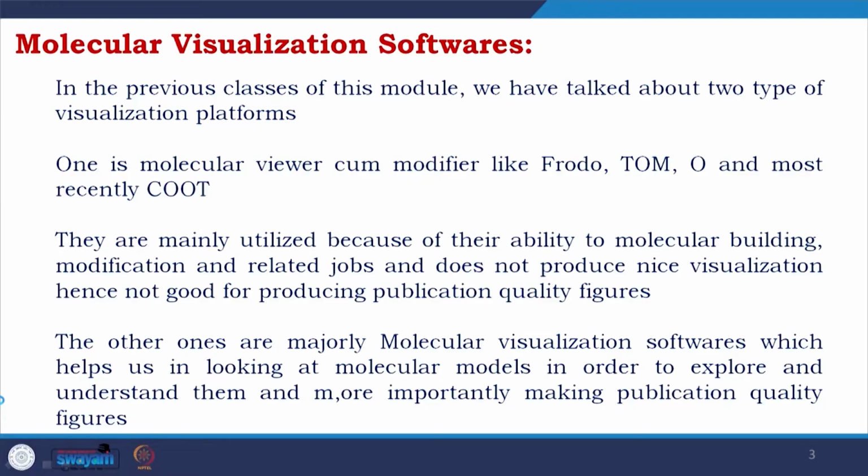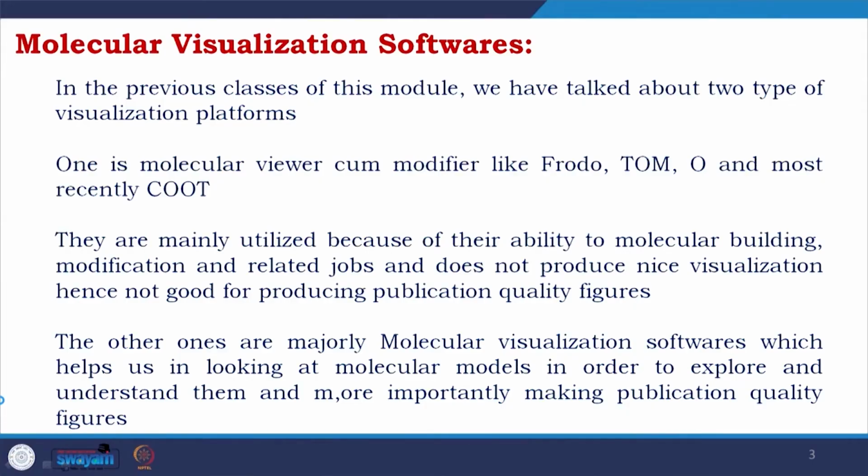So, yes, they are visualization platforms, but they are much more. They are majorly working on model building, like in crystallography you have electron density, you come to Coot and you develop the model from the electron density. The other ones are majorly molecular visualization softwares which help us in looking at molecular models in order to explore, understand them, to do analysis, and more importantly making publication quality figures.